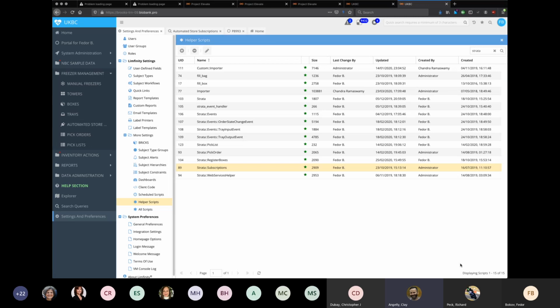So I could see us at some point perhaps bundling, with the purchase of a store, a bundle offer, but we would still have Strata driving all of the governance and the source of record for where samples are within the store itself. But I could see a potential for perhaps bundling Limfinity in a commercial model with a store for certain applications on a customer by customer basis.